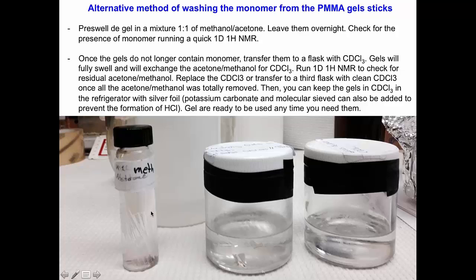Once the monomer is gone, you can transfer the gel to a flask with chloroform. Normally here we use silver foil. And you can also put potassium carbonate and molecular sieves, this is bad spelling here, molecular sieves, in order to prevent the formation of HCl. And the gels will be ready to use anytime.